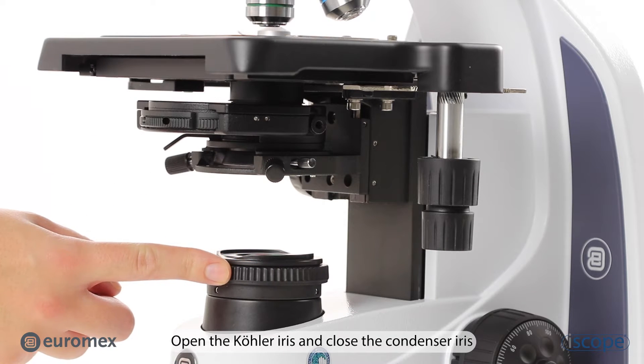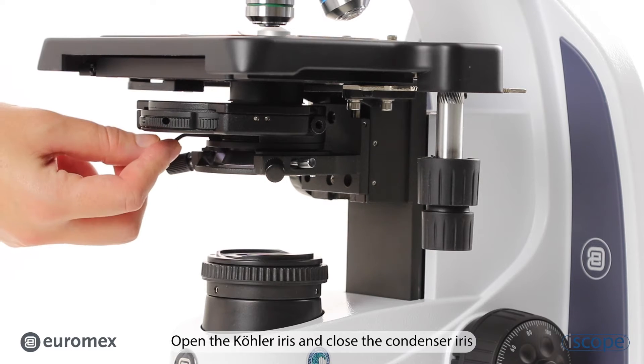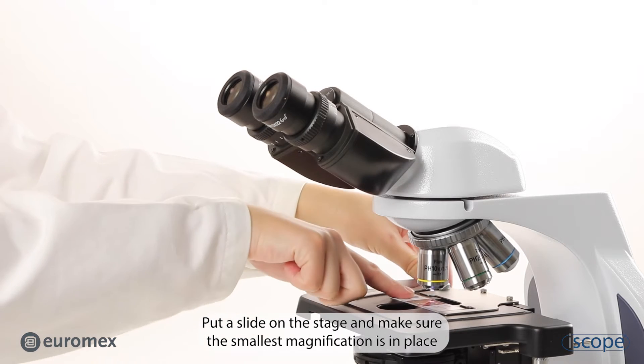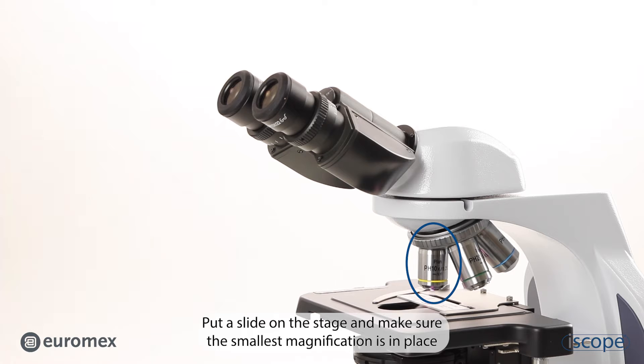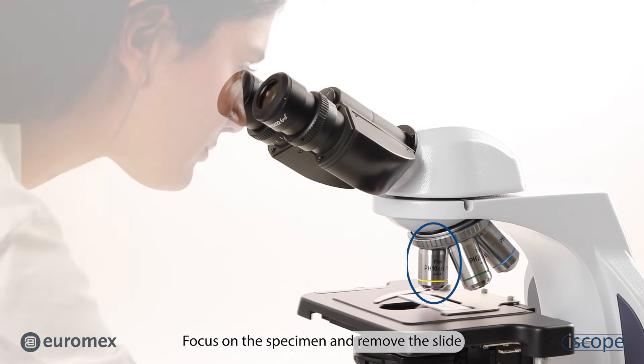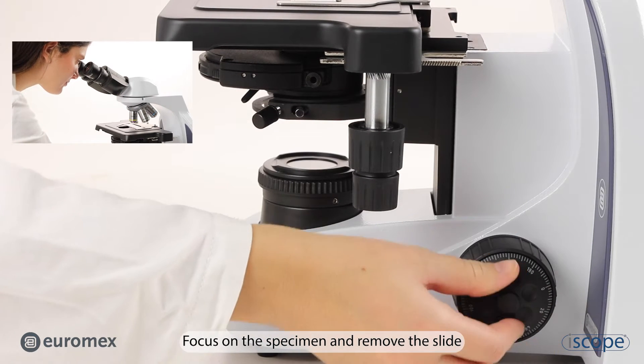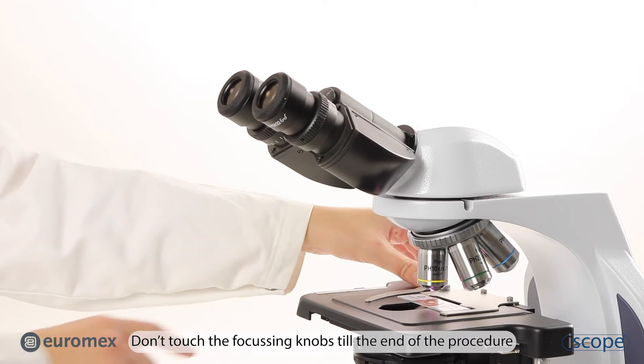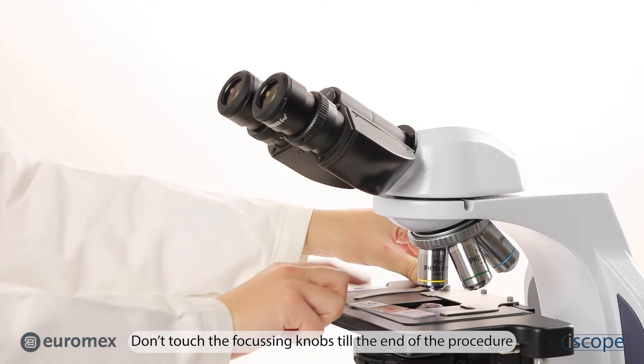Open the Kohler iris and close the condenser iris. Put a slide on the stage and make sure the smallest magnification is in place. Focus on the specimen and remove the slide. Don't touch the focusing knobs till the end of the procedure.